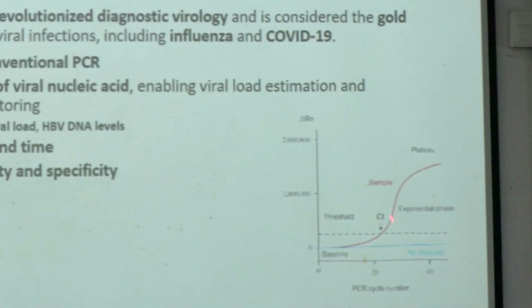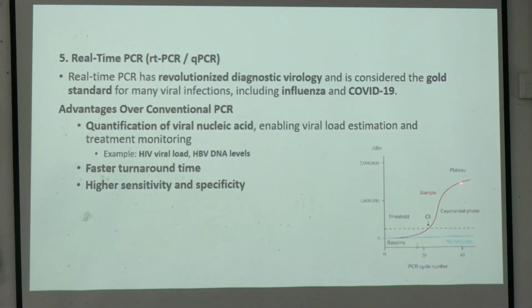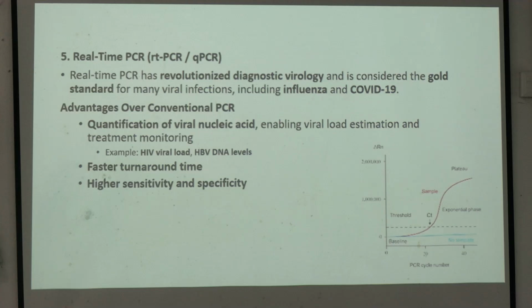See, it looks like an S. So when the cycle starts from 0, এই 0 থেকে বেসলাইন থেকে বাড়তে এখানে প্লেটু হয়ে যাচ্ছে। প্লেটু হচ্ছে কেন? বিকজ তুমি তো সলিউশনটার মধ্যে ডিএনটিপি এনজাইমটা দিয়ে মেশিনে বসিয়ে দিয়েছো, তারপরে তো আর অ্যাড করছো না ডিএনটিপি এর এনজাইম, তো অটোমেটিক্যালি it will get exhausted. So when it is exhausted, the sigmoid curve loses its shape and it becomes a plateau. So that is why we determine the S shape and we determine the CT value.